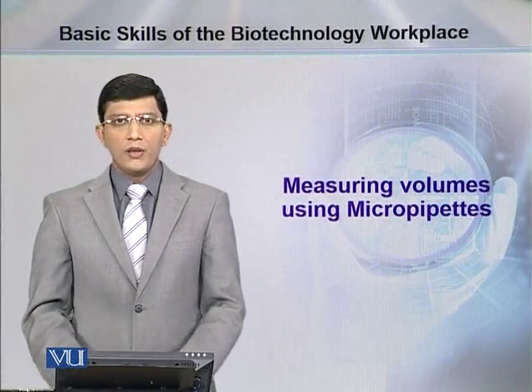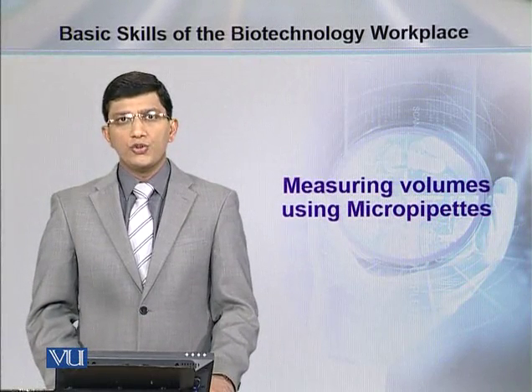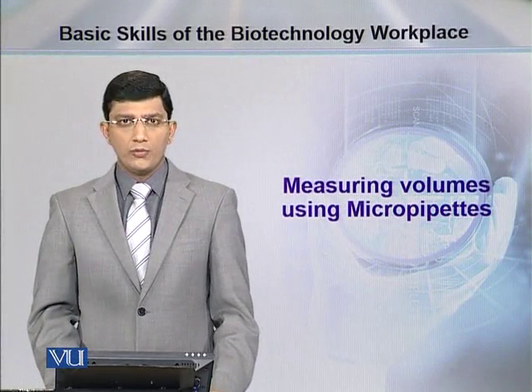Dear students, in this module, we are going to talk about how to use micropipettes to measure the volumes.